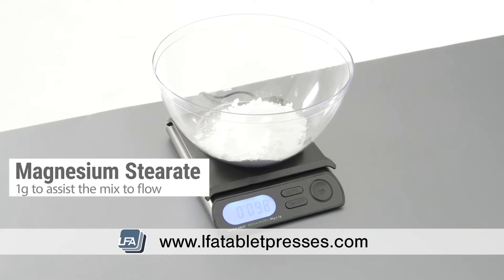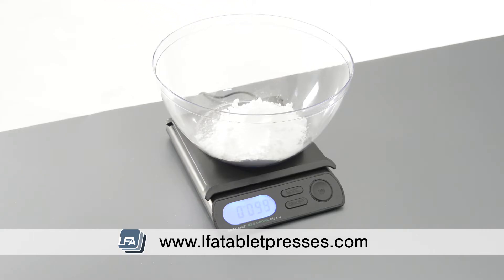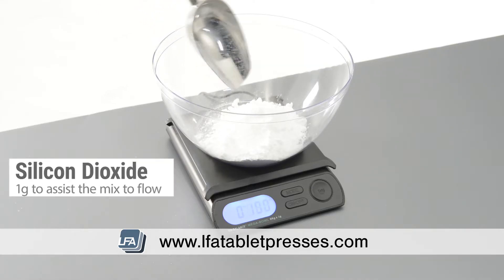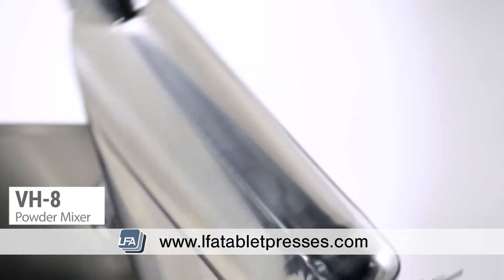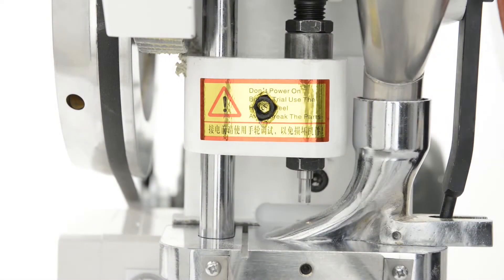Followed by one gram of magnesium stearate. We suggest only using a few percentage points of magnesium stearate. If you find your tablets are capping, you may want to remove some stearate from your mix. Lastly, one gram of silicon dioxide. We'd now add this to our mixer.